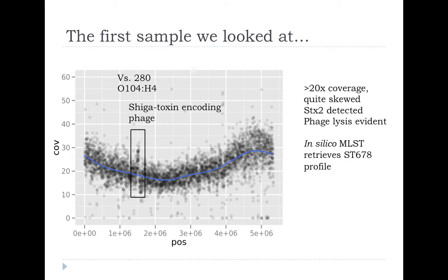He aligned all of the sequences from that metagenome against the reference genome that we already had for the outbreak strain. It's a little bit annoying the way this is being projected, because these coordinates are just the coordinates in the genome. Basically, this is 5 million, 4 million, 3 million. These are the positions along the genome. And these little dots here are where there is a match in the reads from the metagenome.